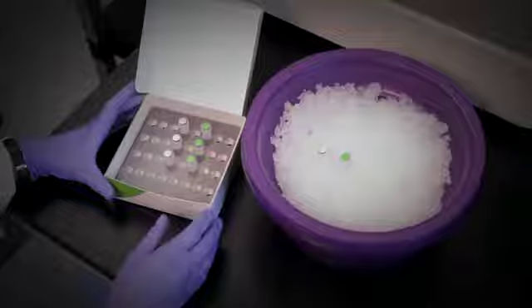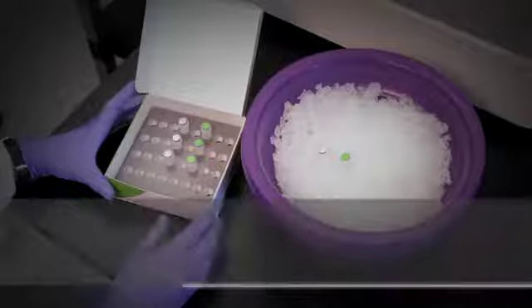It is also important to note that the capture probes and reporter probes are long, linear nucleic acid molecules labeled with fluorescent dyes that are just barely soluble.